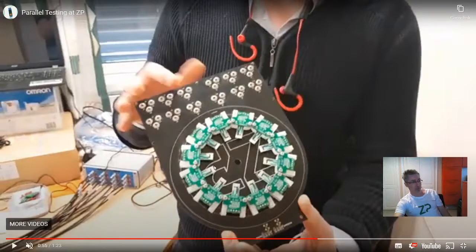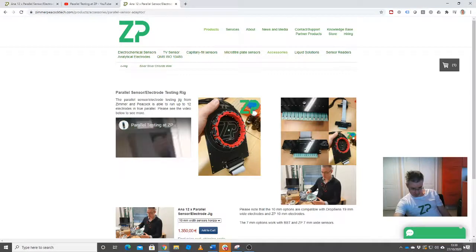You can see that we can mount the electrodes horizontally, or as shown earlier in the video, vertically as well. The nice thing about a board like this is that for each electrode we've got connection points for the working, counter, and reference — otherwise it would be what you'd call a rat's nest of wiring.